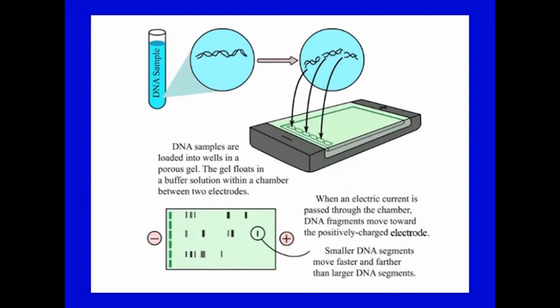Here in this figure, like I was showing, the gel is cast, and you can see the wells, a few of them here. Now, you have a DNA sample, and there could be more than one DNA sample, with one sample loaded into each well. This sample could be treated, for example restriction digested, so from one DNA sample you get many DNA fragments. These DNA fragments need to be separated.